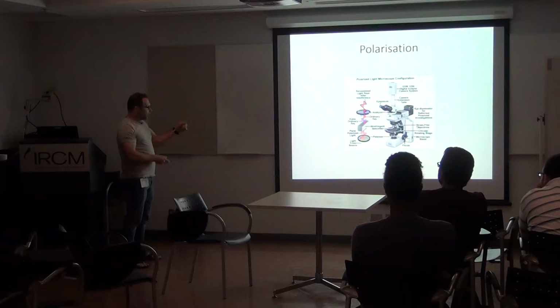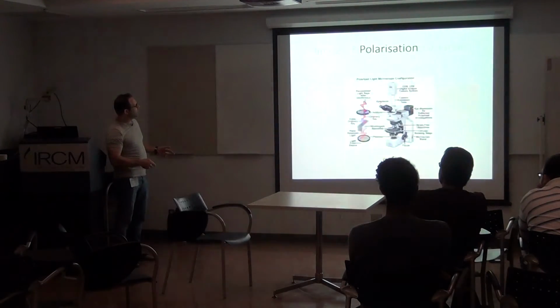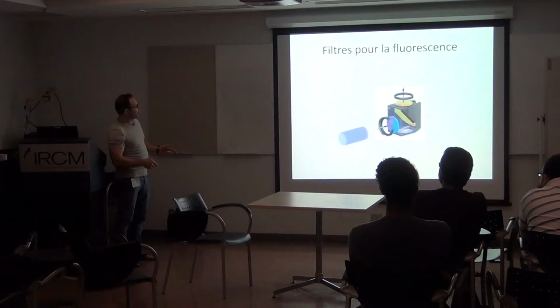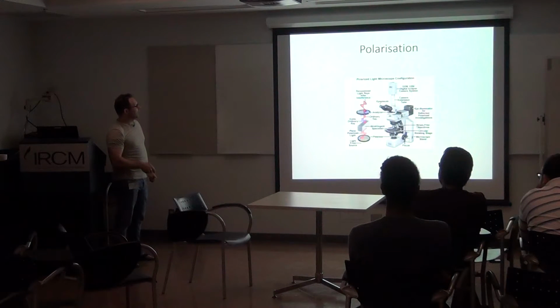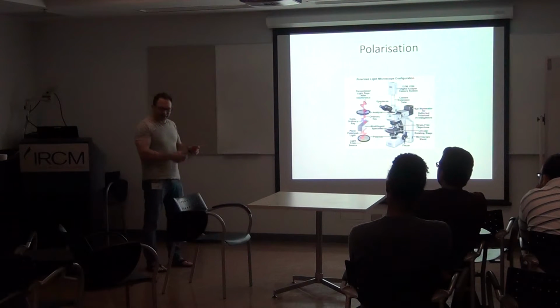Okay? And those birefringent, do I have it? No. Oh, sorry. I thought I would have the calcite. It's called calcite. It's a crystal that has a really organized way.